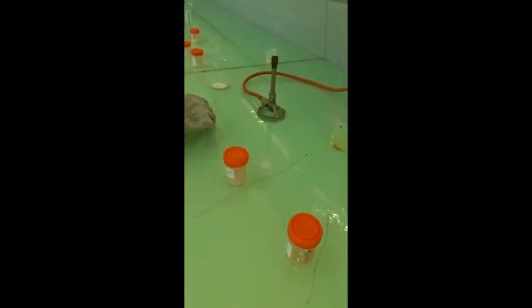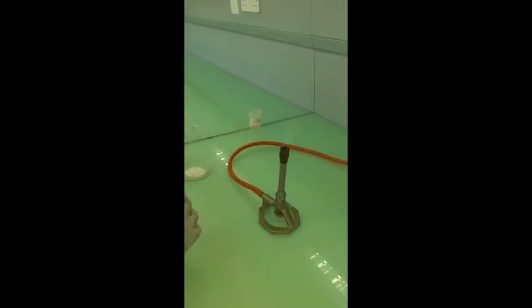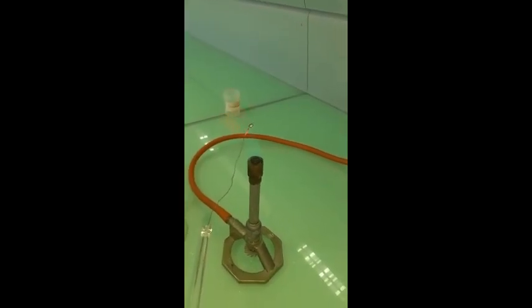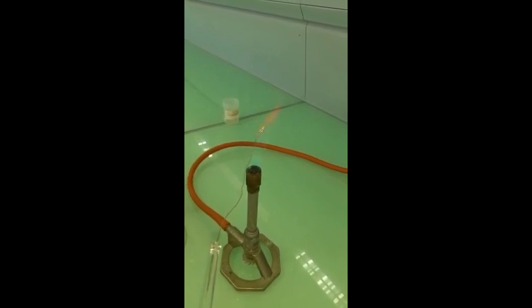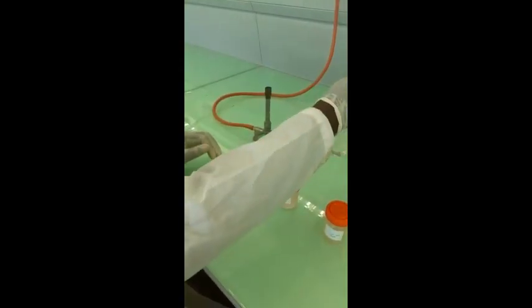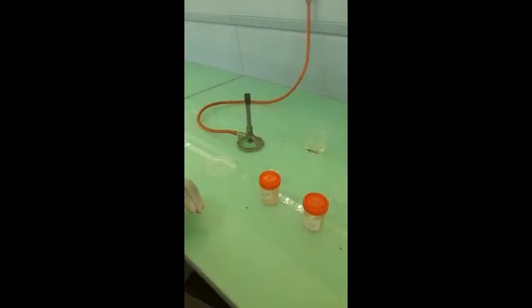And now we shall attempt a strontium compound. Our next sample is a sample of a copper compound.